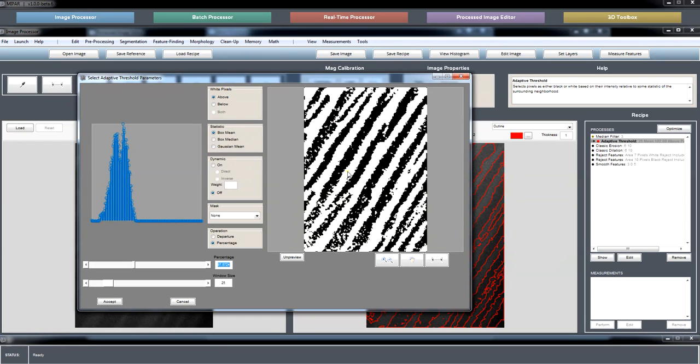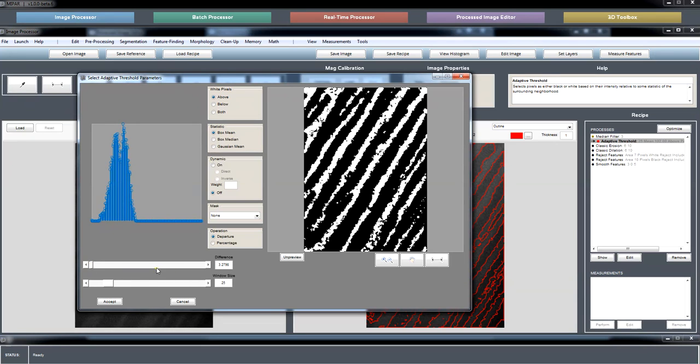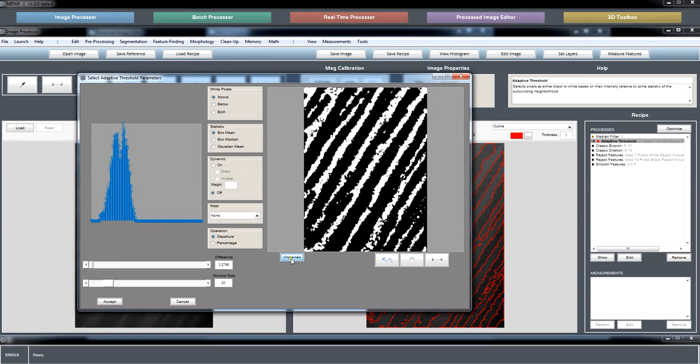And if it's less than 97%, then it gets made black. So you can assess each pixel based on its percentage of its surrounding intensity or on a strict deviation from that intensity. So in this case, a pixel would need to be more than 3 intensity values away from its local average in order to be white. And if it's 3 units or less, then it's black.